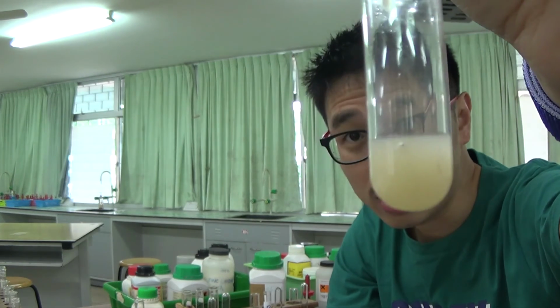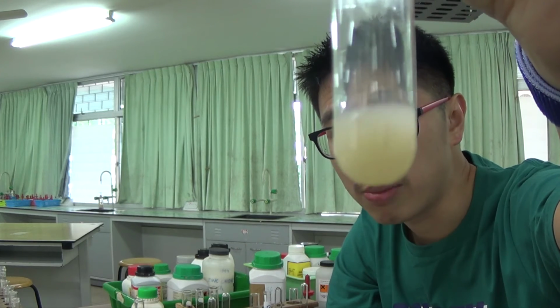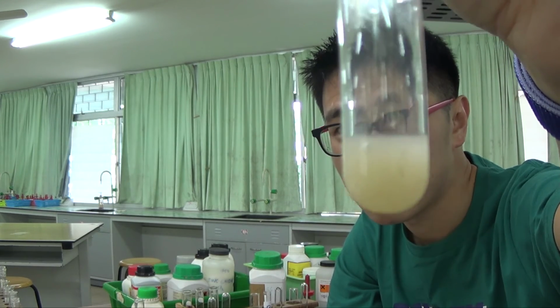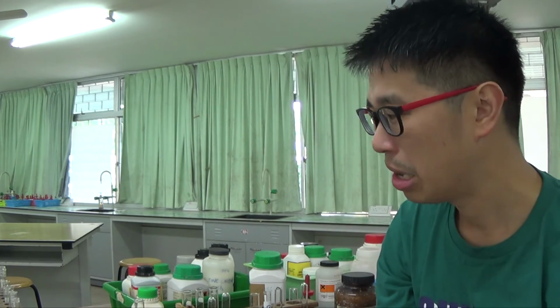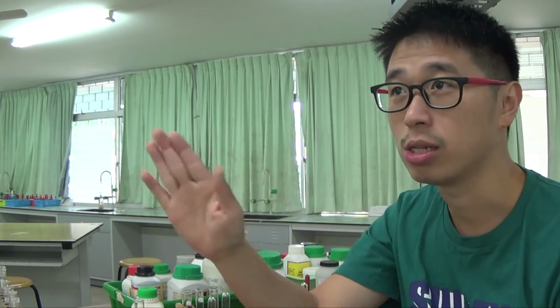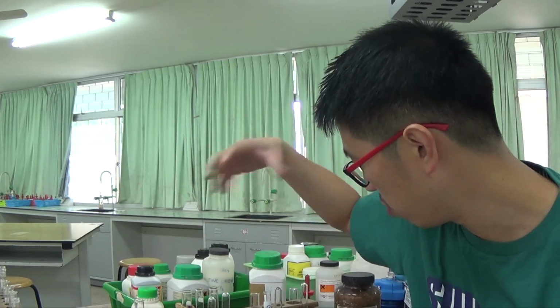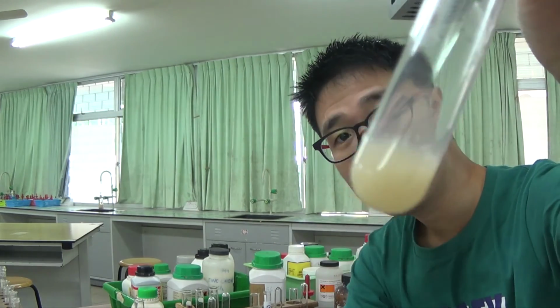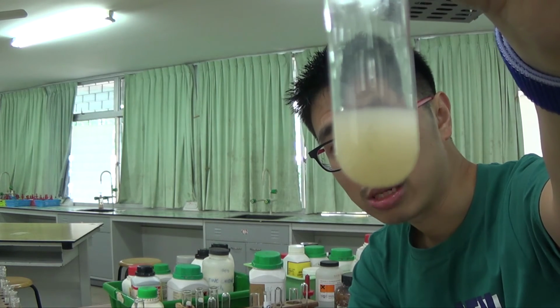This is a very tricky one, because the solution was very clearly brownish, so the precipitate looks a bit brownish. So do you say a white precipitate or a brown precipitate? Unlike the previous one, where the solution was very light to begin with, almost not colored, so it was a white precipitate, here the solution was a bit orangey to begin with, and now you get a precipitate.